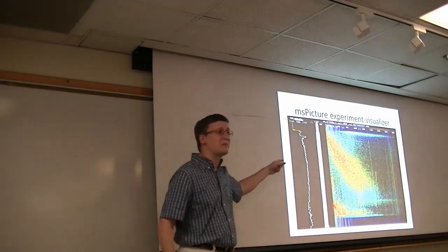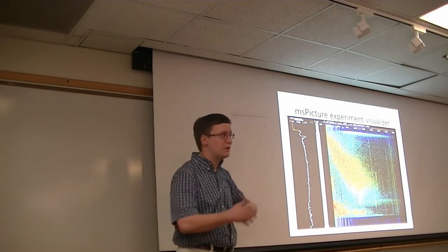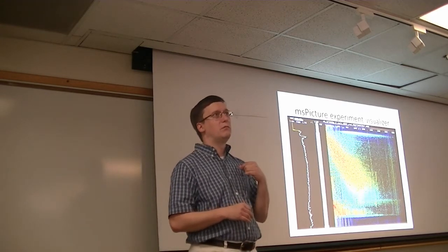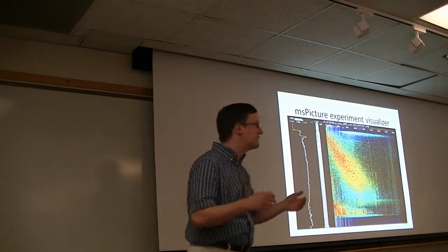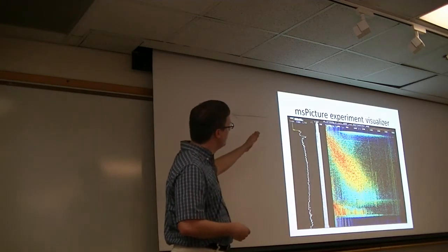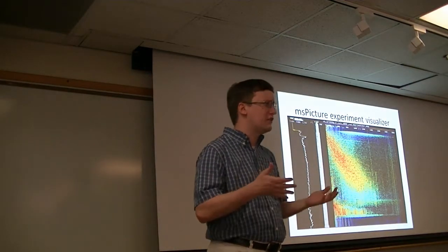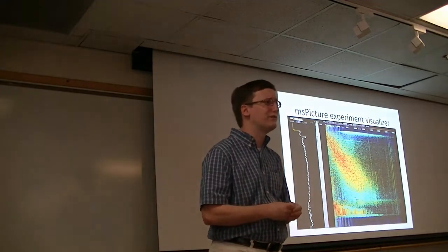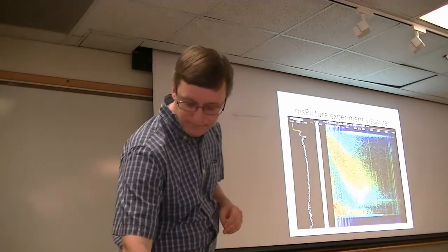You can also see some amount of dependence on the m/z value in response to time. This can reflect the increasing hydrophobicity of larger ions, essentially. So MS Picture is really valuable when you want to figure out whether your data are sane or not. Simply drawing a picture of your raw file can be very informative. This is one of the tools that the group from Stanford, from Parag Mallick, has produced.